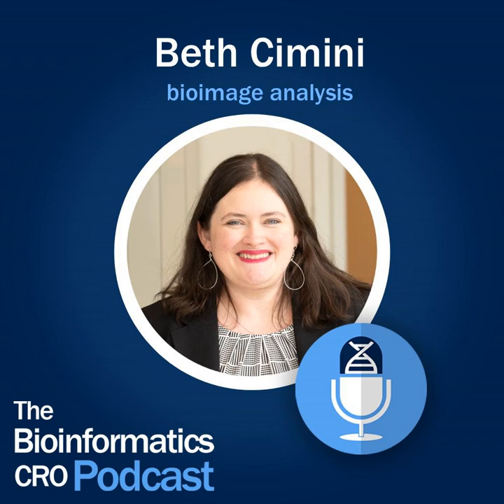Finally, what should people remember from this conversation? I hope what they remember is that microscopy and image analysis are really powerful because they're diverse, but therefore it's a discipline that's full of a lot of subtle pitfalls, and it's good to talk to experts about it, but that the experts are out there, we exist, and we're kind nerds who love talking about this stuff. So find us on image.sc or find us in the GloBias database or come to my team's office hours. We're out there, we want to help you, and we really love talking about this stuff.